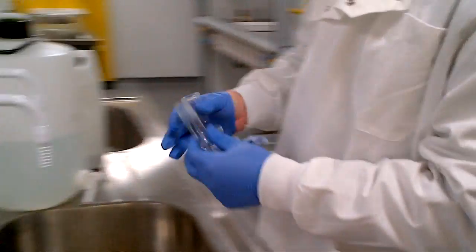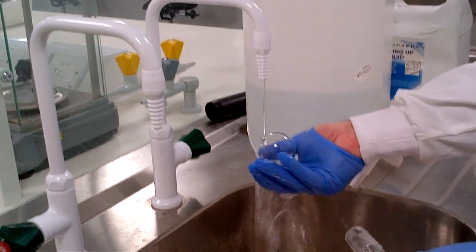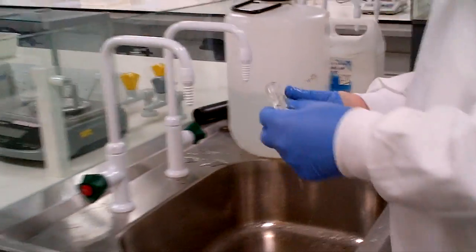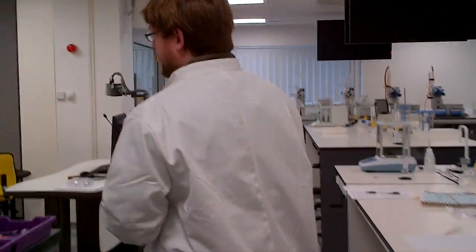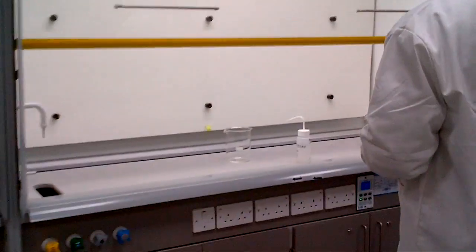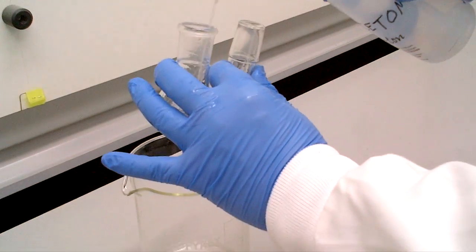But because this unknown liquid today is water based, we're just going to encourage you to take a touch of tap water, rinse, swirl, rinse, swirl, swirl and rinse again. Any waste tissue paper goes in your waste receptacles around the lab. Back we go again towards the fume covered areas. We look for some acetone. We've got to rinse and clean the outside of the flask. Good practice to clean the outside of the flask, the stopper, then the inside.